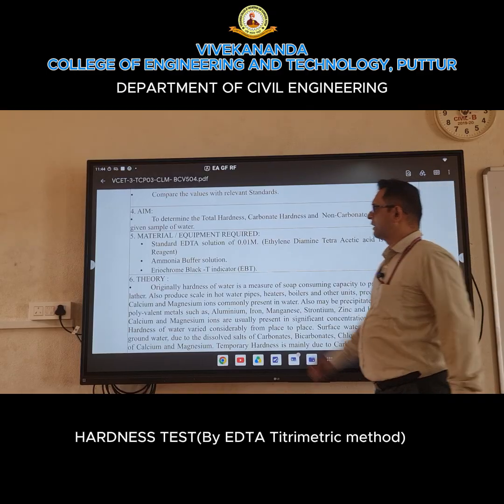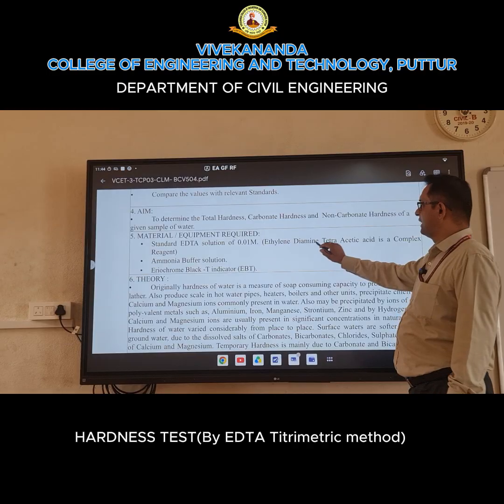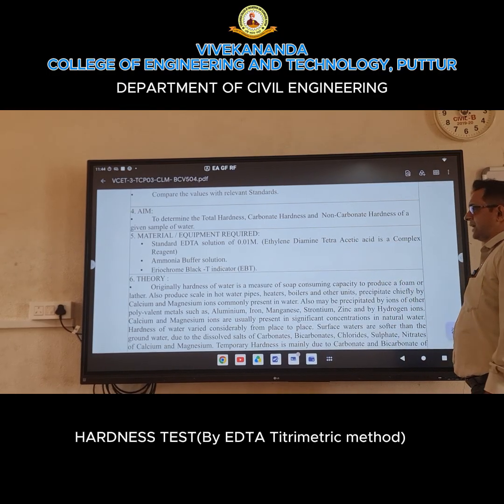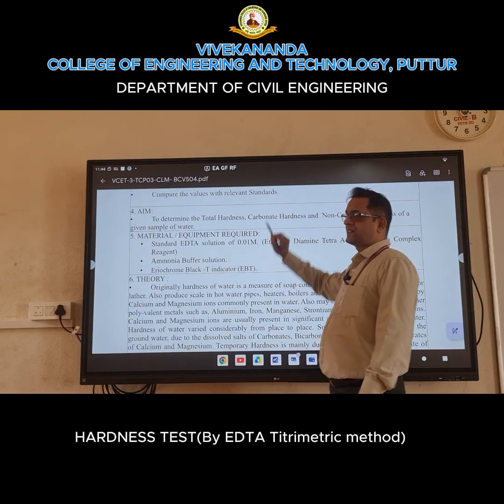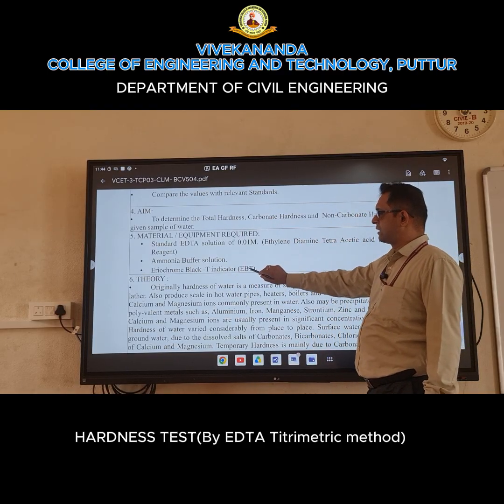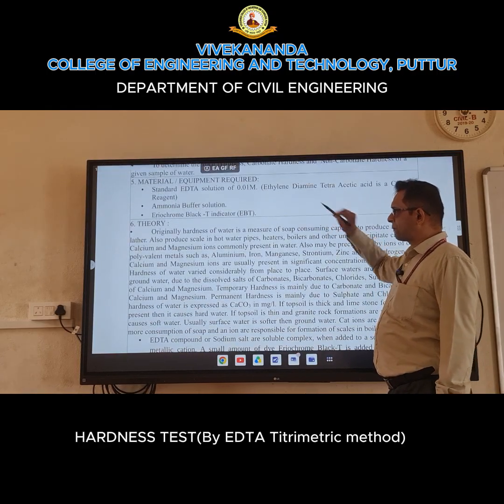So we require standard EDTA solution, that is 0.01 molar ethylenediaminetetraacetic acid, then ammonia buffer, and Eriochrome Black T. This is for the total hardness as well as temporary hardness. Next, we will see the concept of hardness.